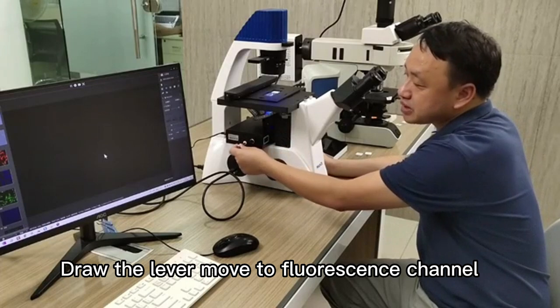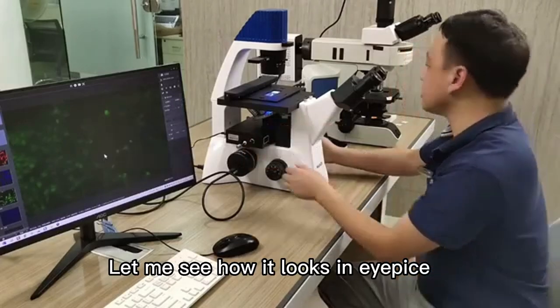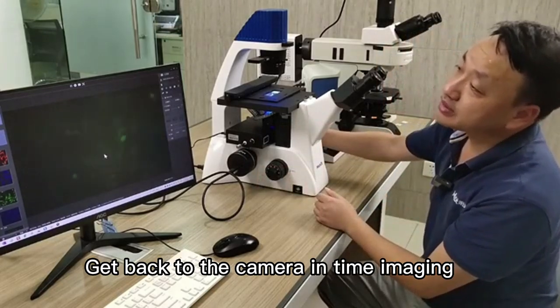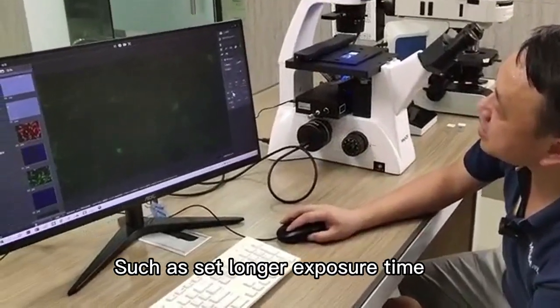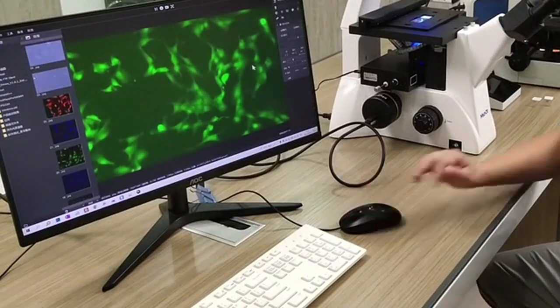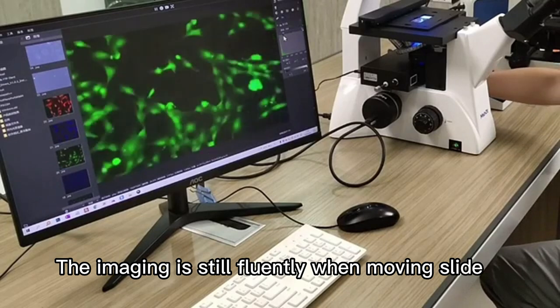There is a digital screen to show light intensity. Draw the lever to move to the fluorescence channel. Now it is the blue channel, where you can see green color fluorescence. Light intensity on the digital screen shows 90%. You can find the area you want to see quickly, then get back to camera for live imaging and get focusing. Fluorescence signal is weak, but we can make it brighter with the software that comes with the camera, such as setting a longer exposure time. Now I have got the correct brightness. Also by adjusting the histogram in the software, you can get a more pure background — the function is like black balance. The imaging remains smooth when moving the slide.